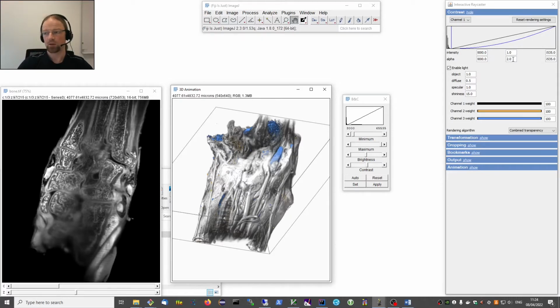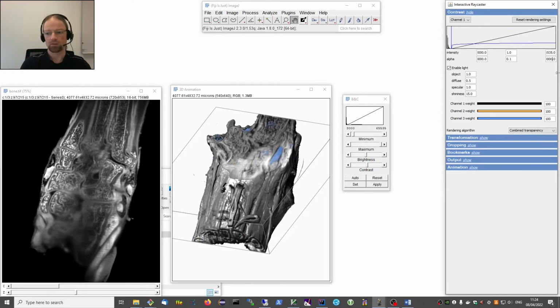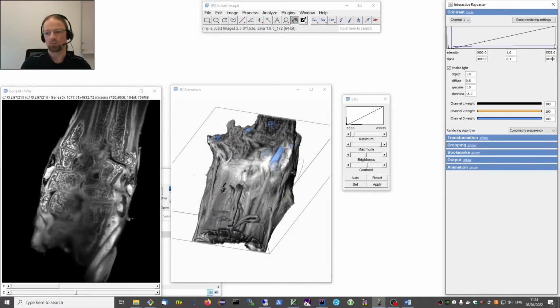And so maybe we'll first start and bend this curve upwards, which means it gets basically more opaque. And now by just increasing the maximum, and I will just add some zeros here, if you watch this blue line here, you can see as this moves down, so we'll add more.